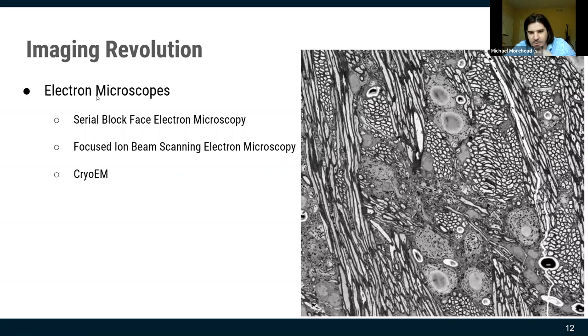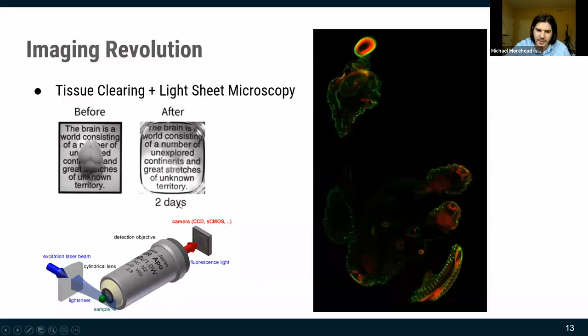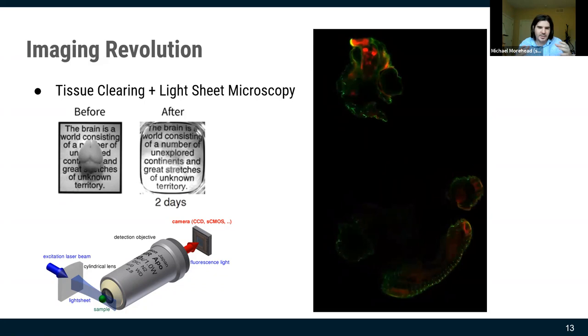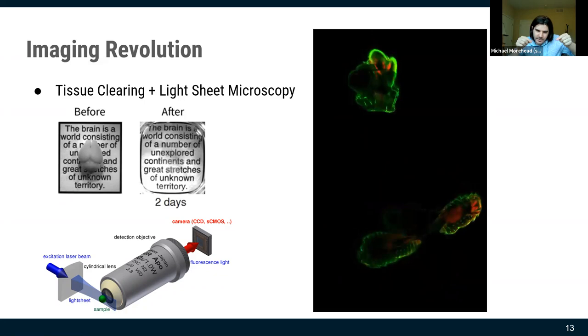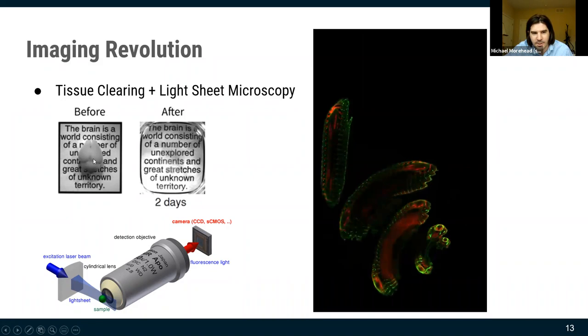You may have heard of the revolution in clarity tissue clearing and light sheet microscopy. With light sheet you force light into a very thin sheet. If you apply the appropriate chemical procedure to tissue — for example a mouse brain — you can make it optically transparent.